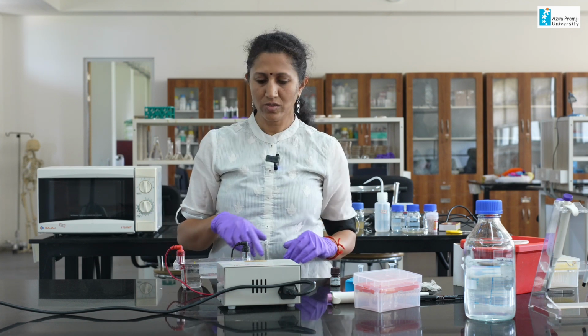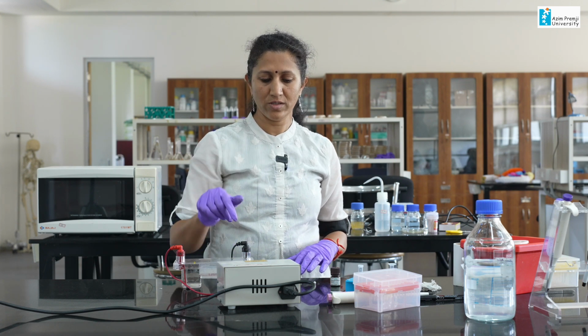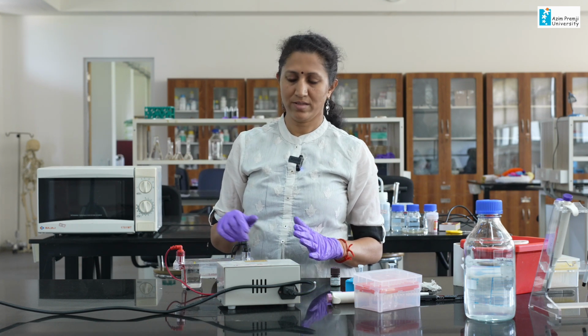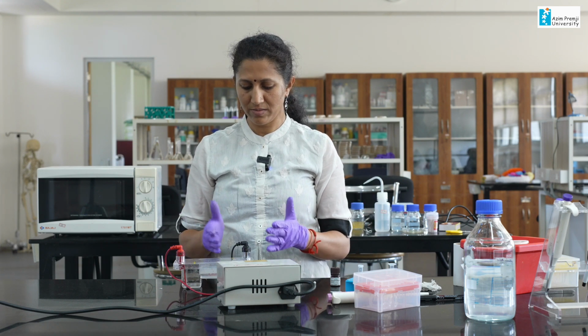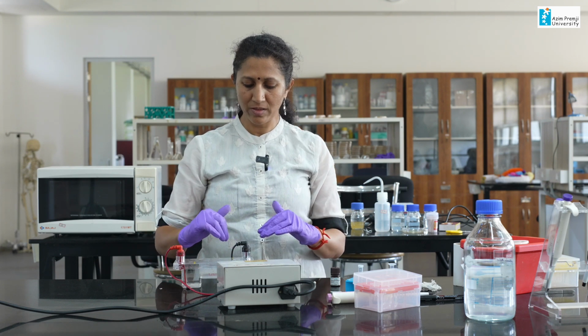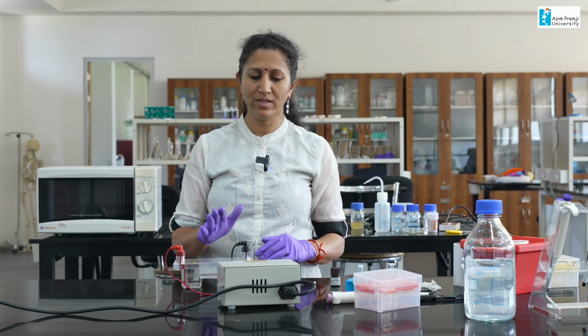Initially when you run, you have to set it to a lower voltage. Otherwise, if you increase it, the temperature rises and it may run fast, but the gel may melt or sometimes the bands may form a smear, and you will not get clear, distinct bands. So, it makes a smear. It is always better to run at a lower voltage.